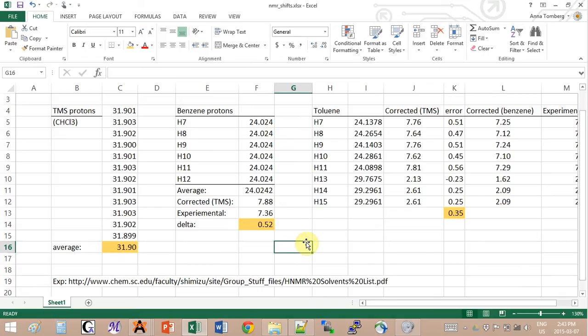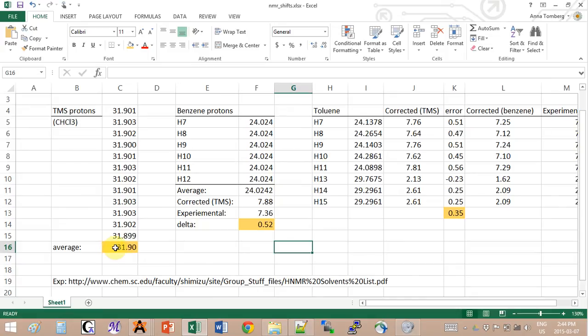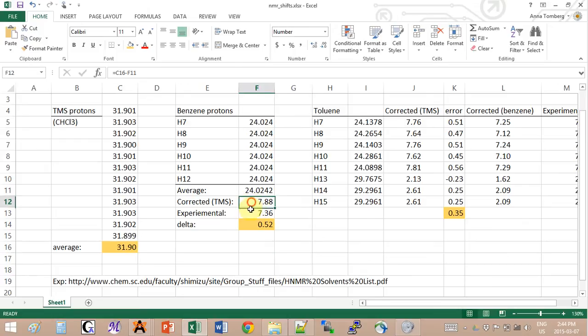That's basically what we get - the same value for the protons. I took the average and I get 24.02. Now to obtain the shift, what you have to do is subtract this value for benzene from the value of TMS.